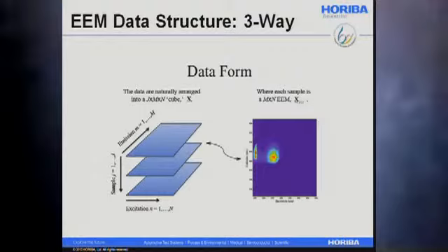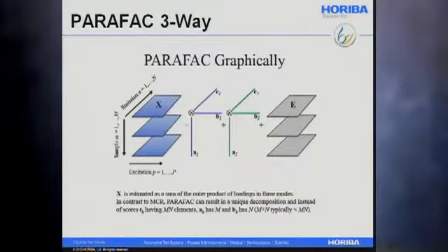It breaks down the spectrum of each individual sample into a number of components that have the three-way matrix definition in terms of excitation, emission, and sample. These components can then be calibrated and stored in libraries, and even transferred from laboratory to laboratory because the instrument calibration is very effective.